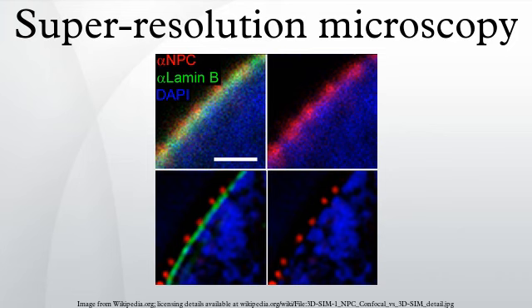Localization microscopy: SPDM. SPDM, the first described localization microscopy technology, 1997, is a light optical process of fluorescence microscopy, which allows position, distance and angle measurements on optically isolated particles well below the theoretical limit of resolution for light microscopy. Optically isolated means that at a given point in time, only a single particle or molecule within a region of a size determined by conventional optical resolution is being registered. This is possible when molecules within such a region all carry different spectral markers.